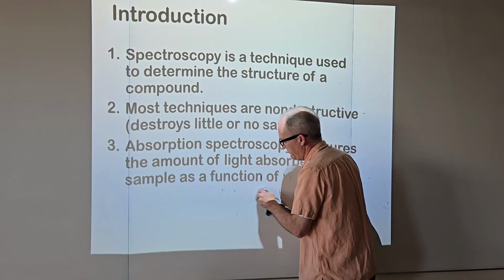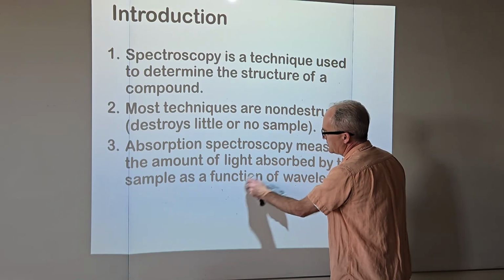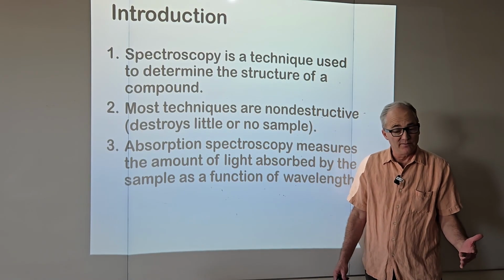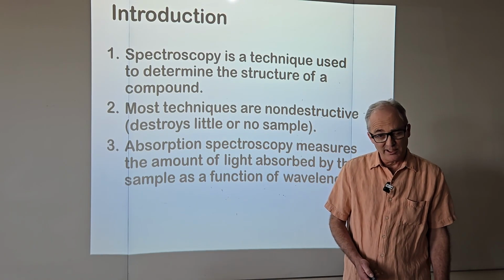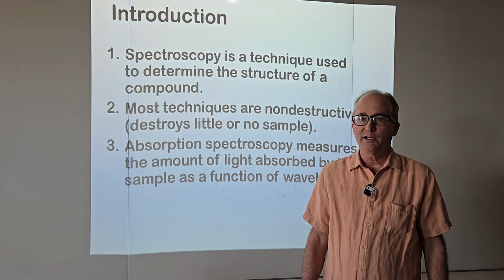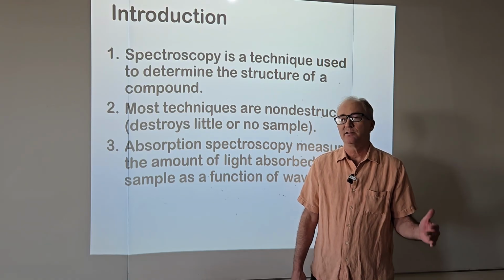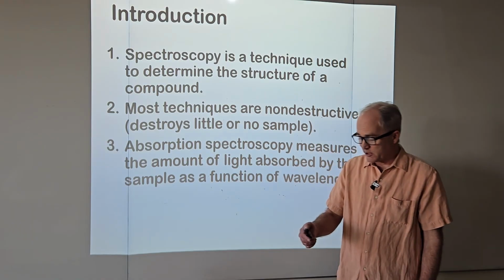So in general chemistry, if you determined a copper solution concentration using spectroscopy, the wavelength was fixed where the compound had a maximum absorbance. It was probably in the visible spectrum of electromagnetic radiation. So electromagnetic radiation can interact with matter. Matter can emit electromagnetic radiation. Of course, you'll recall Planck's constant: E equals Planck's constant times frequency, and the photoelectric effect and all that good stuff.